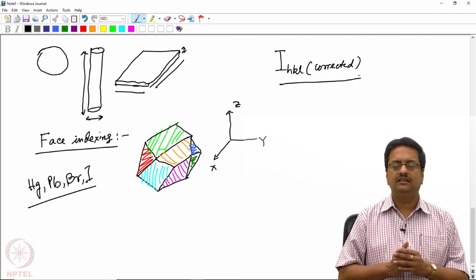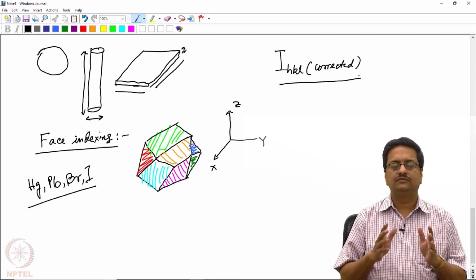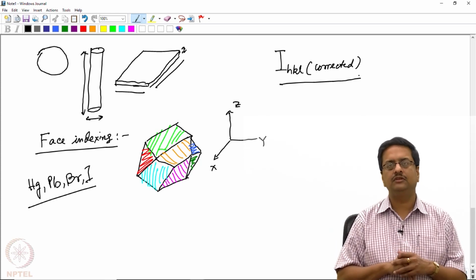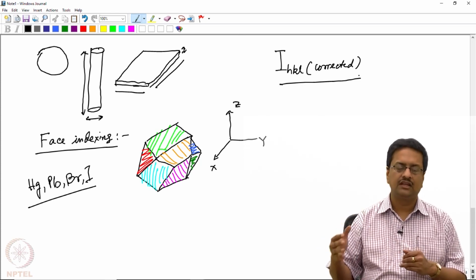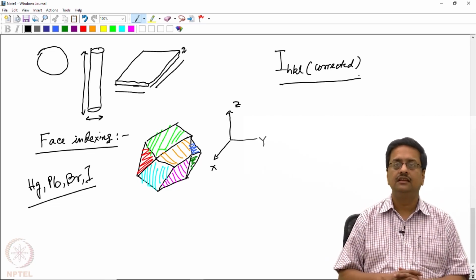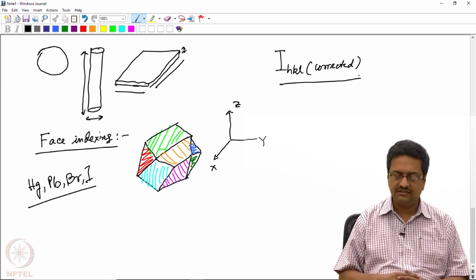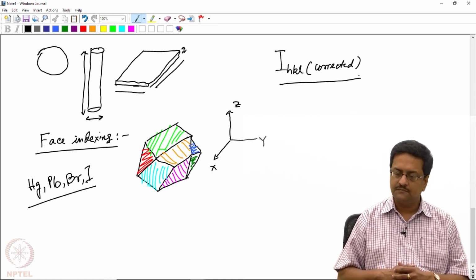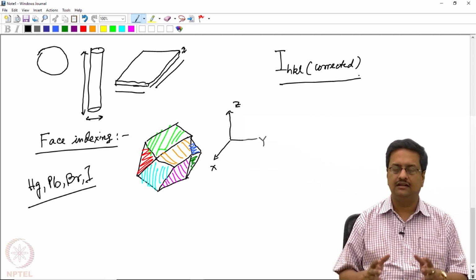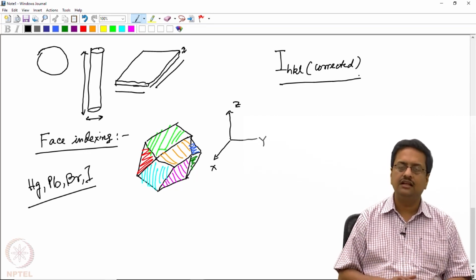One point I want to mention here is that the sample to detector distance becomes an important aspect, because with the sample to detector distance increasing, the diffracted beam intensity decreases drastically. So a correction for sample to detector distance is also necessary in case the data was collected with more than one detector distance during the data collection process. In general, the sample to detector distance is fixed during a data collection, and hence the correction for that detector distance is not incorporated in the calculation.